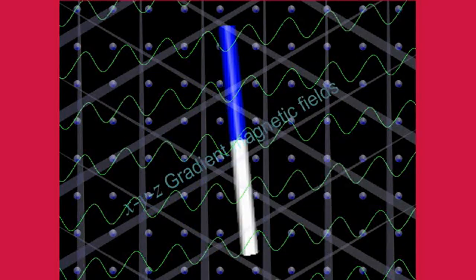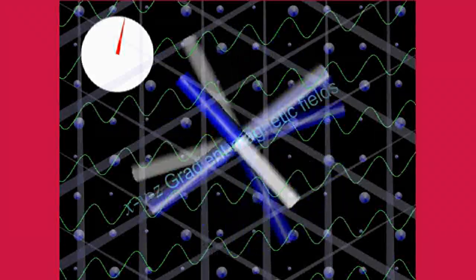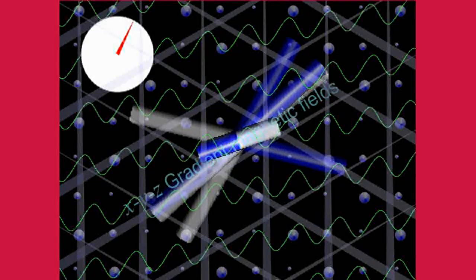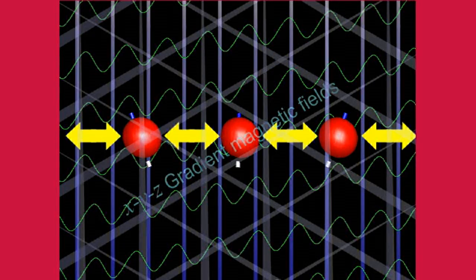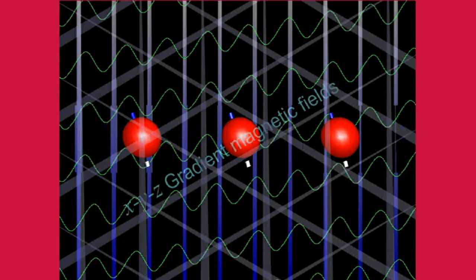However, it gradually splits into multiple magnetizations with different rotation speeds, and the overall magnetic force becomes weaker than when rotating with one magnet. The time it takes for the strength of this magnetization to reach 36.8% of the strength when rotating with the first one is called the spin-spin relaxation time. Spin-spin relaxation is different from spin lattice relaxation caused by the transfer of energy, because the magnetic environment of one proton in the tissue differs in the strength of the magnetic field applied to each nucleus due to the influence of other protons around it. It occurs when individual nuclei rotate at slightly different speeds and the magnetization becomes disjointed.